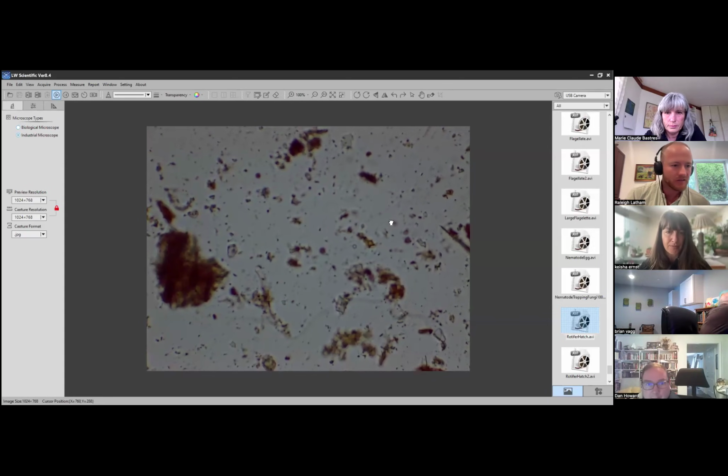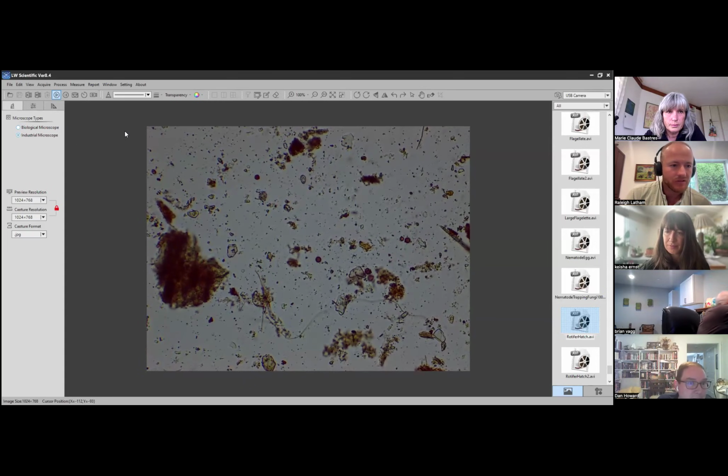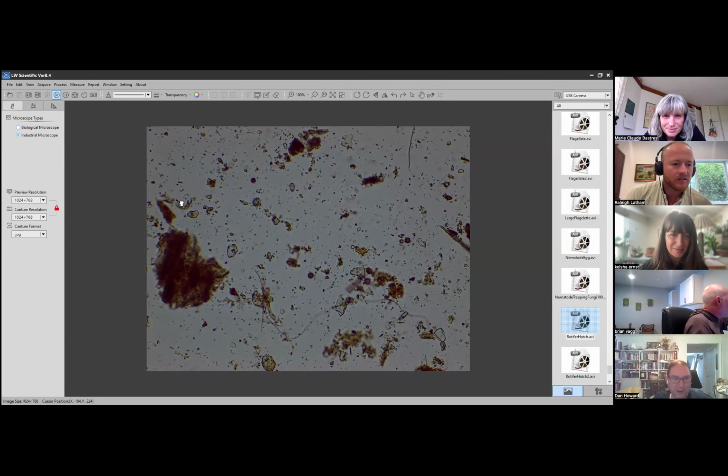Okay. Dan, how about let's hop over to your sample and we could talk about how you made this, how you made your compost, and what you've been seeing under the microscope. Yeah, all right, great. Hopefully you can see that okay. Yeah, it's so smooth. The sample's been on there for a while, so I'm starting to see some movement, and the liquid coming through.